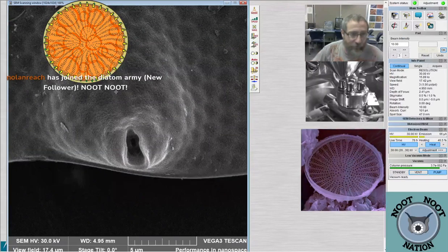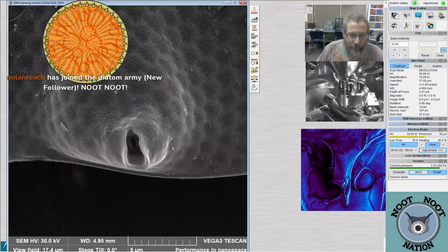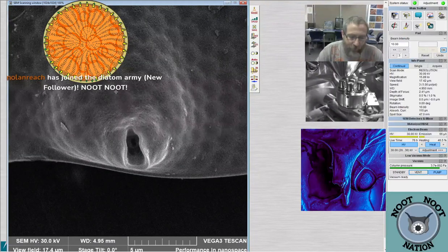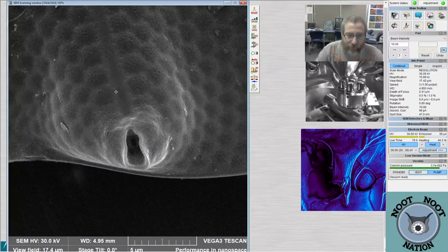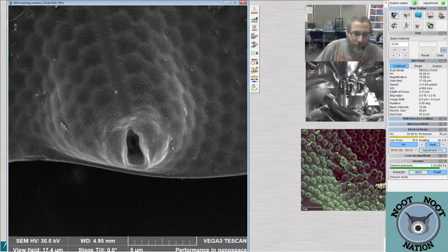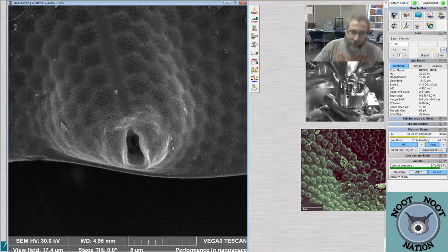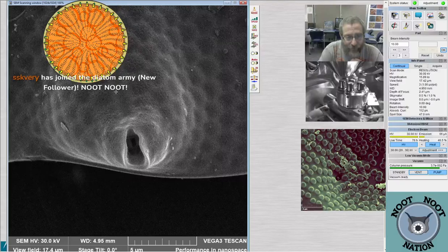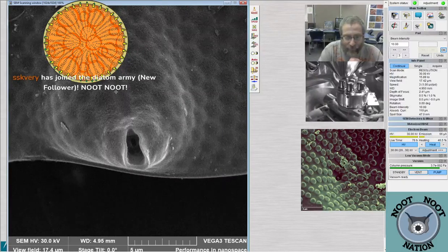So your depth of focus could be, in a camera, your f-stop. If you have a very narrow f-stop, then just a little bit of your image is in focus at the same time, and then you could stack images on top of them, each one with just the part that's in focus. And my camera at home does this by itself. I can just tell it, stack focus these pictures.